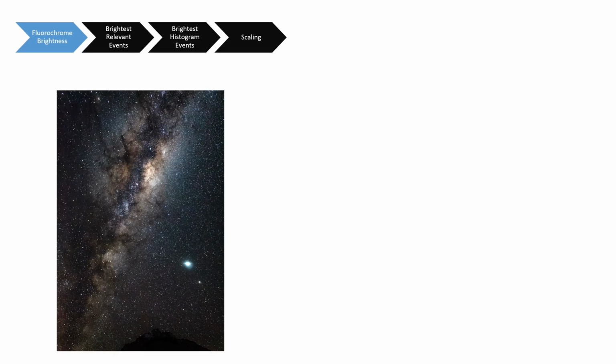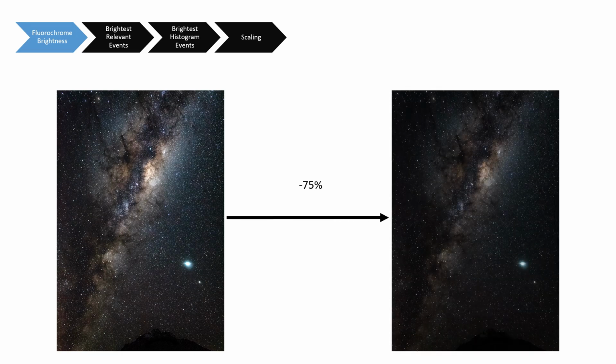I'm going to steal an idea from photography to illustrate the rule here. If I take a clear image that is well exposed and remove 75% of the brightness, the image is well conserved in terms of colour, for example. This is a bit like your reference. It is relatively easy to predict what a signature would look like when you make it dimmer.